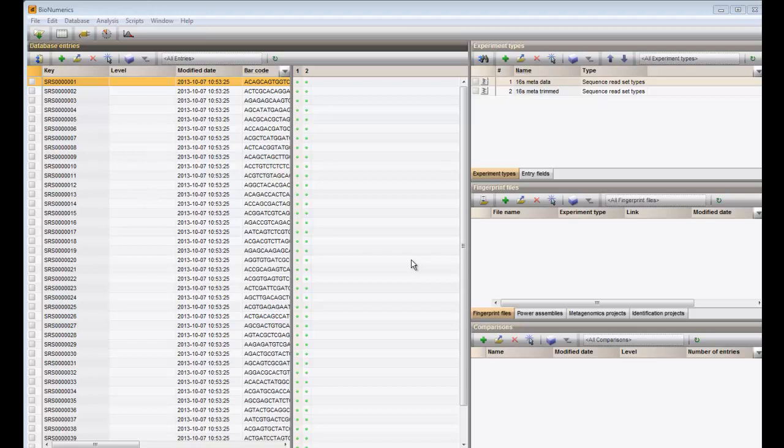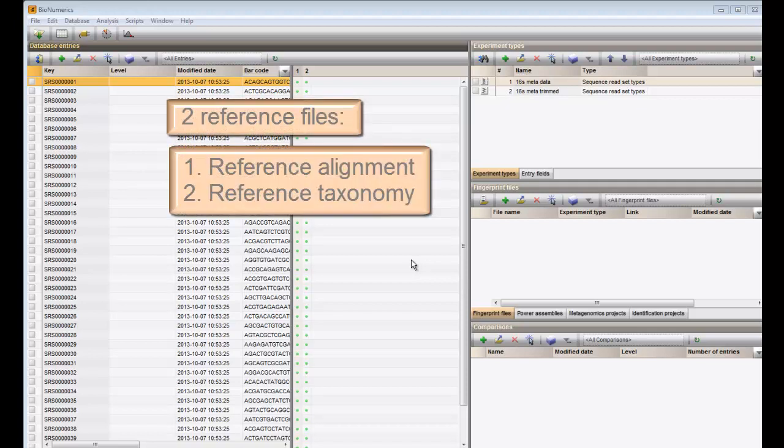The 16S identification analysis in Bionumerics relies on two reference files. First, the alignment algorithm implemented in the metagenomics analysis requires the presence of a template alignment, also called reference alignment, which is used to align the sample sequences to. Second, the methods implemented to obtain classification results on the read sequences rely on the presence of a reference taxonomy to obtain a taxonomic label for each of the read sequences.